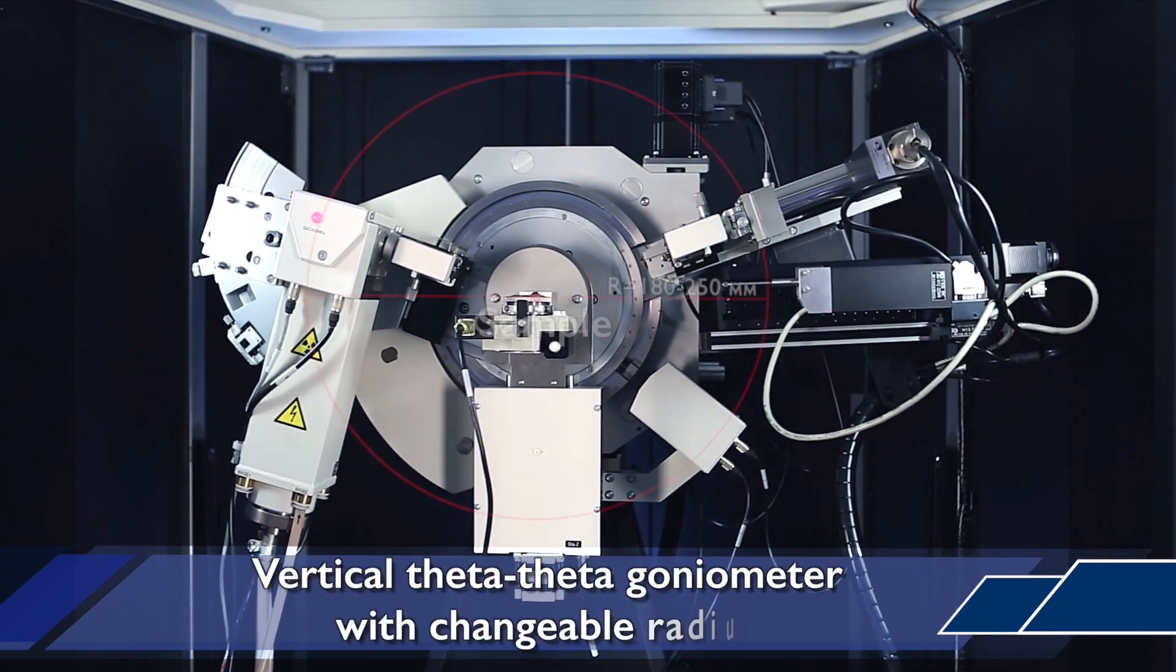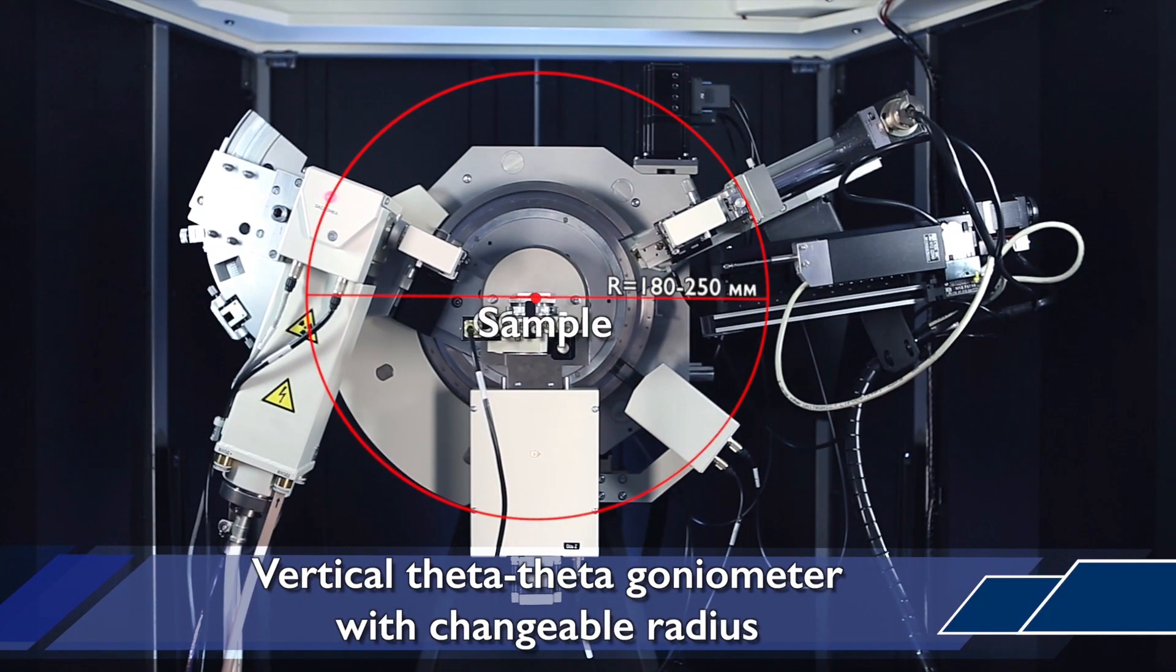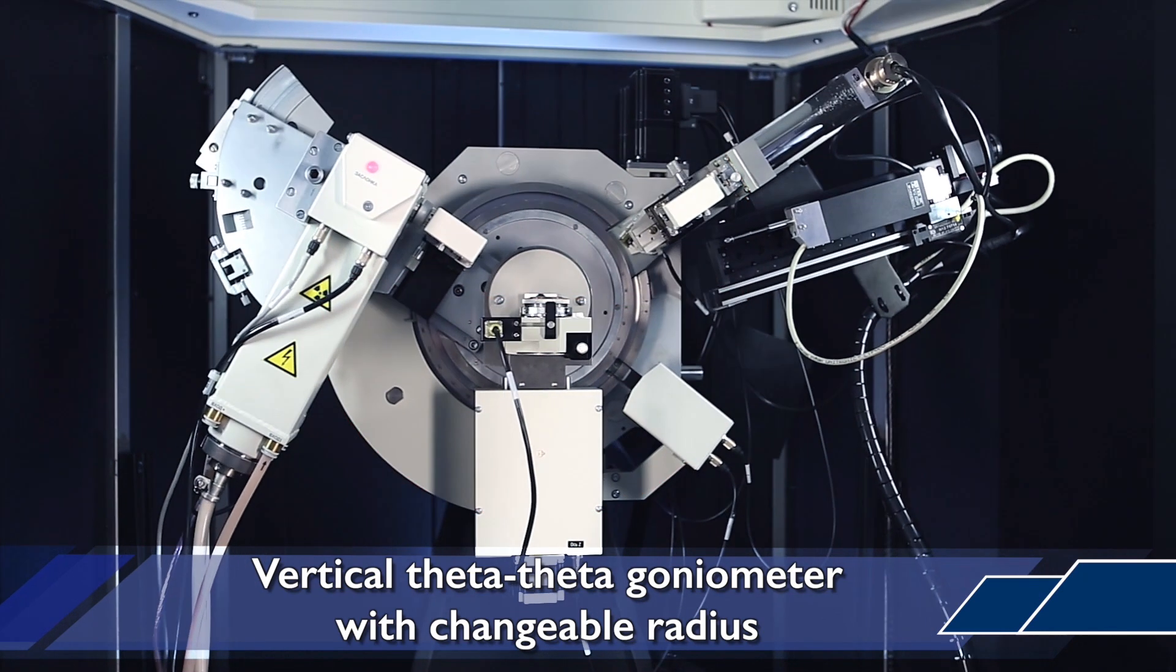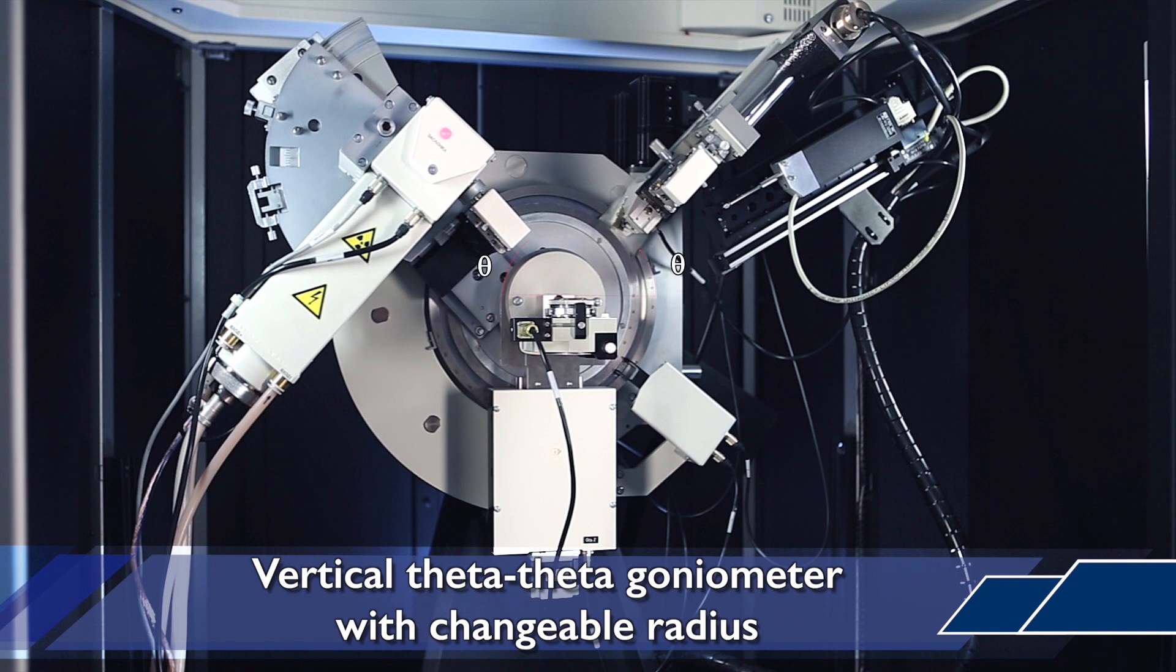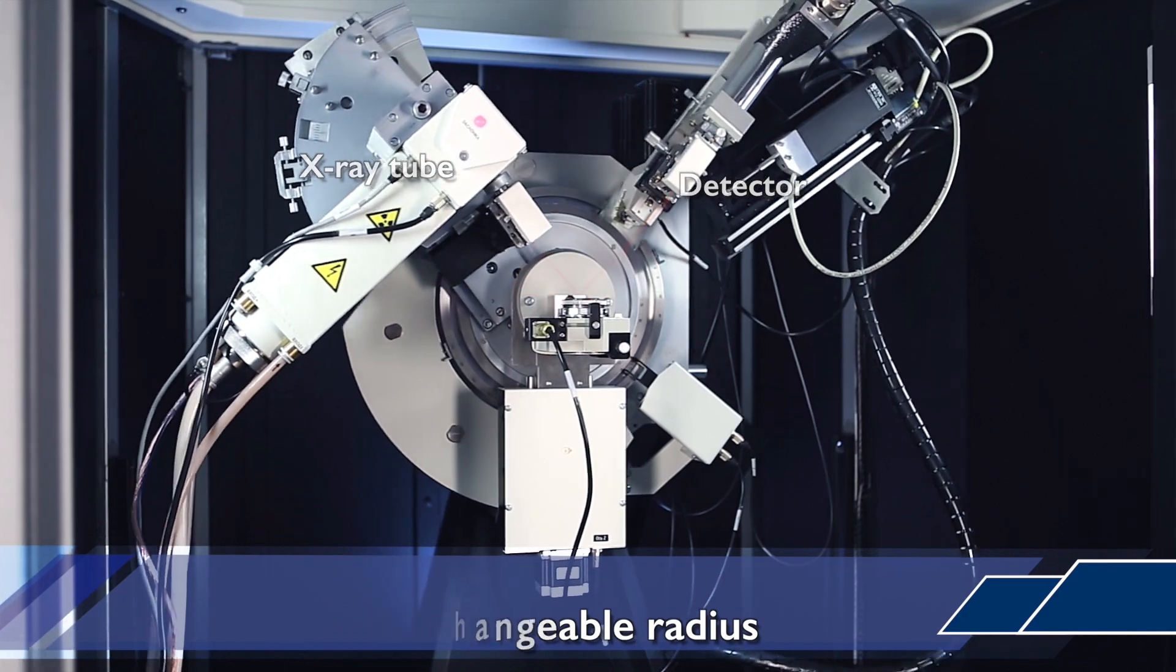The goniometer has a variable radius from 180 to 250 millimeters which allows changing angular resolution of X-ray optical system and enables installing different attachments, chambers and sample holders.